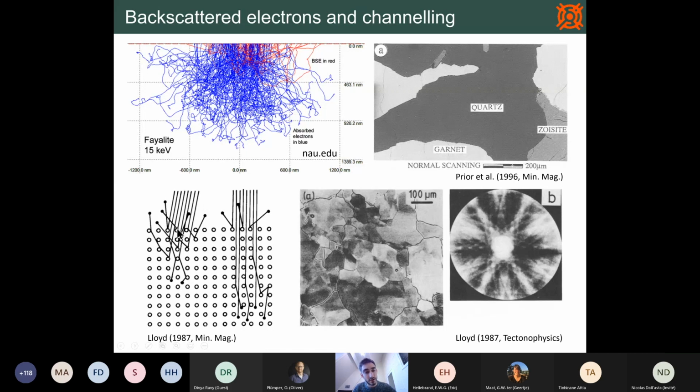So in this case, the electrons aren't going to get so far into the crystal, but if they hit at a particular angle, the electrons will be what we call channeled along the lattice planes of the crystal, and many of them will make their way further in. And that's going to actually lead to fewer electrons being emitted again at the surface. So now if we set up our operating conditions appropriately, particularly doing things like a shorter working distance, so that as we scan, this incident angle varies more.